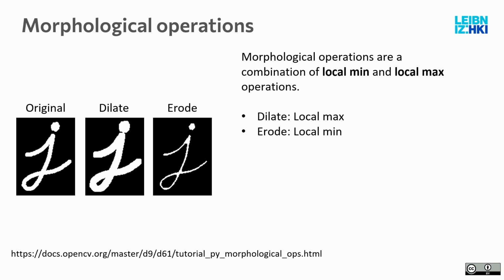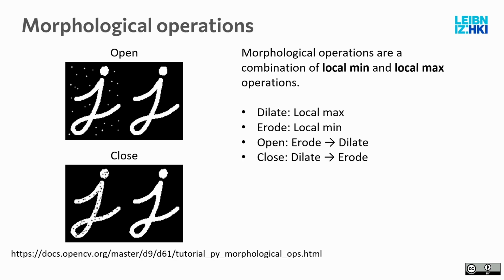The opposite operation is erosion, and you see here what happens if we apply an erosion operation. And these can then be combined into higher order operations, the ones you have seen already, only a bit. It's specifically the opening and closing operation.